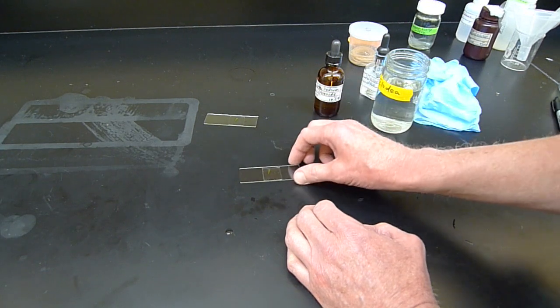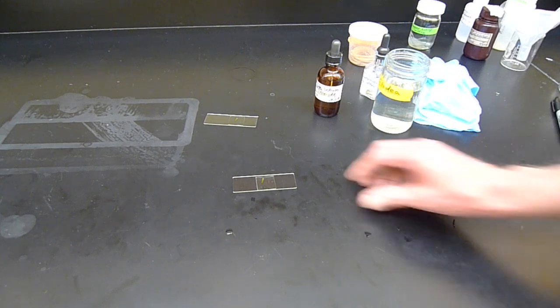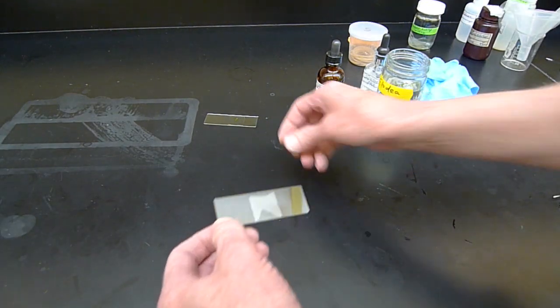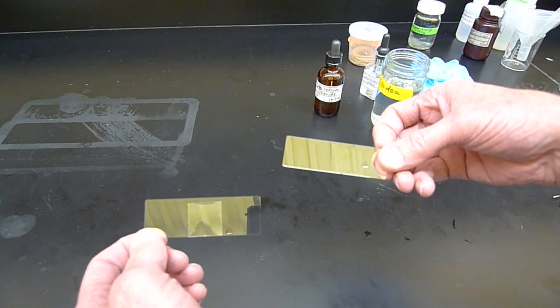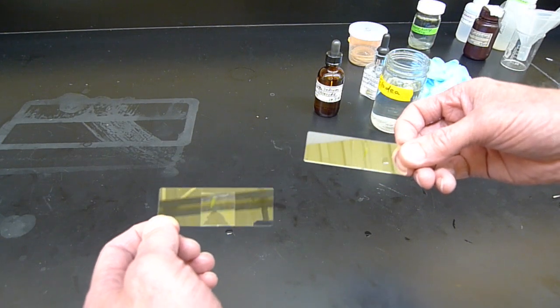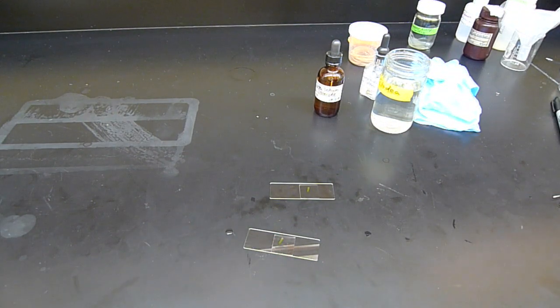Then I'm going to put these on a microscope and take photos, hopefully, so you can see the difference: what the cells look like in the presence of 10% sodium chloride and in just distilled water. So then there's no video there, it's just going to be photographs. You can decide which one is in sodium chloride, which one is in the distilled water. And no doubt your instructor will have you with that one too.